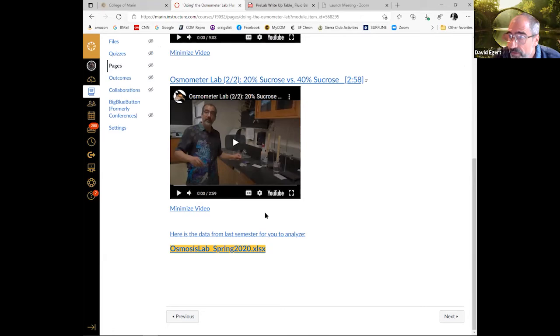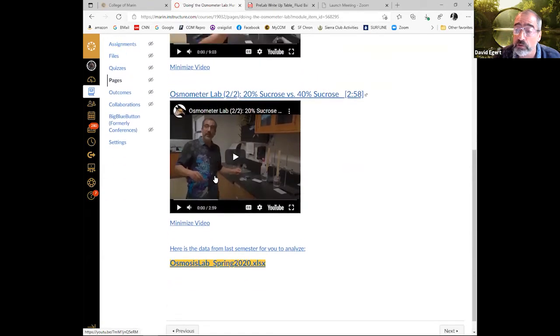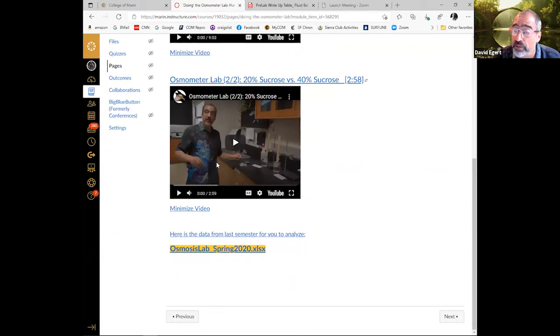This is something I don't have to babysit you while you watch. I'm going to spend the next few minutes showing you this and then let you head into it. These two videos just show the setup of the osmometer and what we're doing, so you have a really good sense of what actually happened.